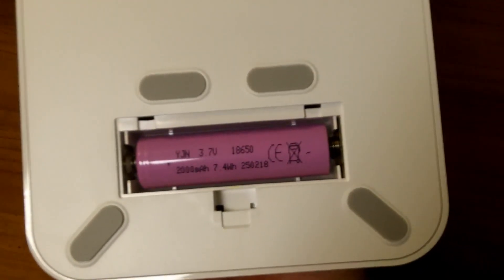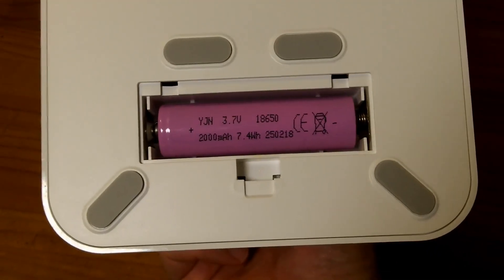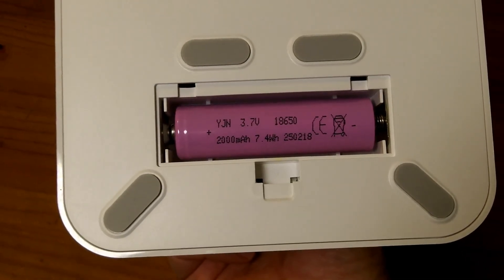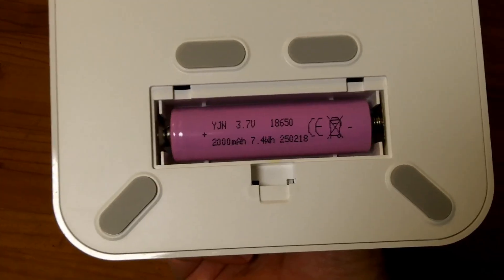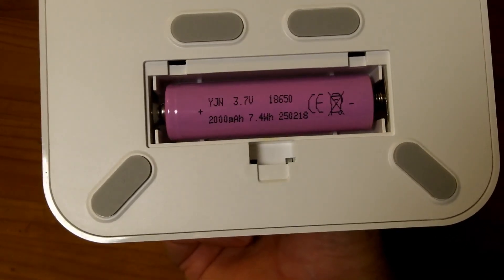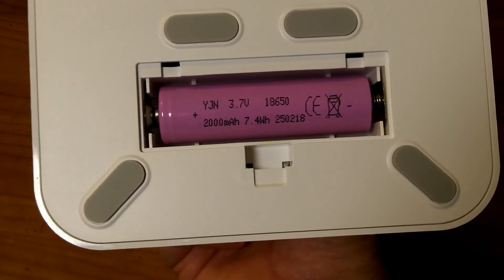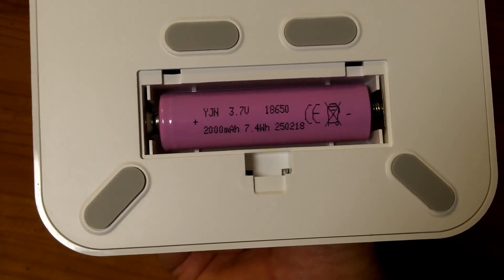Now under the bottom, in a standard kind of snap-off battery door, there is a user-replaceable 18650 cell. So it will work autonomously without a power cord, at least until the battery is run down, and you plug it in to recharge it. And if that battery ever degrades over time, you can just pop it out and pop a new one in.